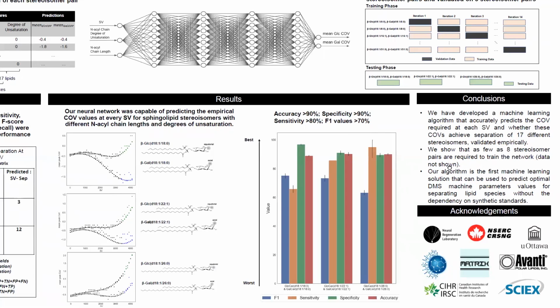So in summary, we have shown the first machine learning solution that can be used to predict optimal DMS machine parameter values for separating lipid species without the dependency of synthetic standards.